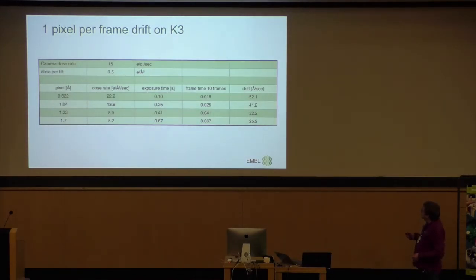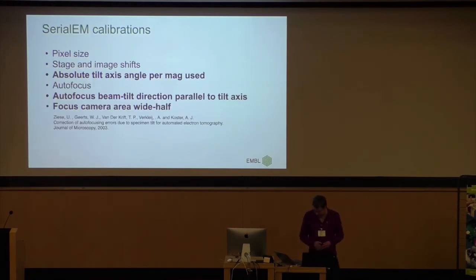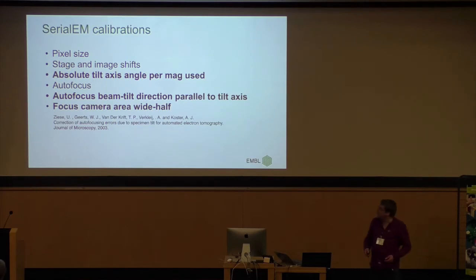Now we got a K3, but then, the dose rate changes, these times change, and then I look at these numbers and it's like, okay, the first thing I'm going to do tomorrow, because I have the cryos booked, is take the drift measurement out. It's just not needed on a K3. So faster cameras help for sure. So that's what I'm going to do tomorrow. This wait time is out, the drift is going to go out. The rest stays in so far until I am absolutely sure that everything runs properly. And then we can see what else we can skip.